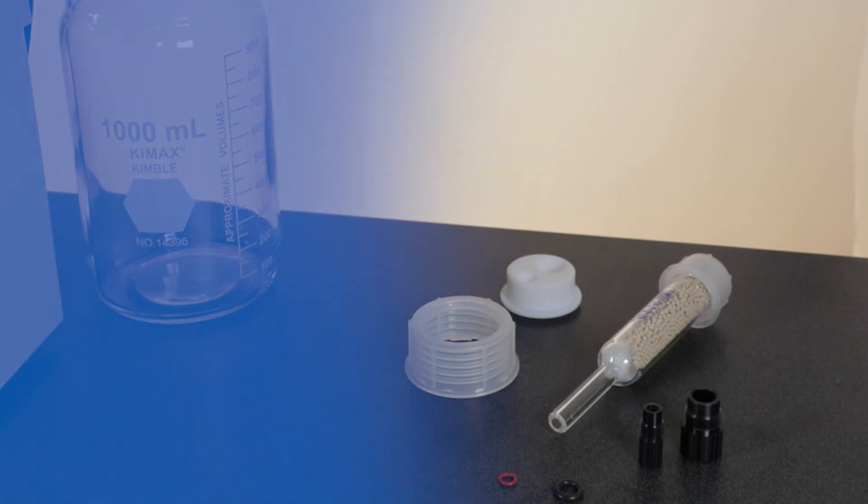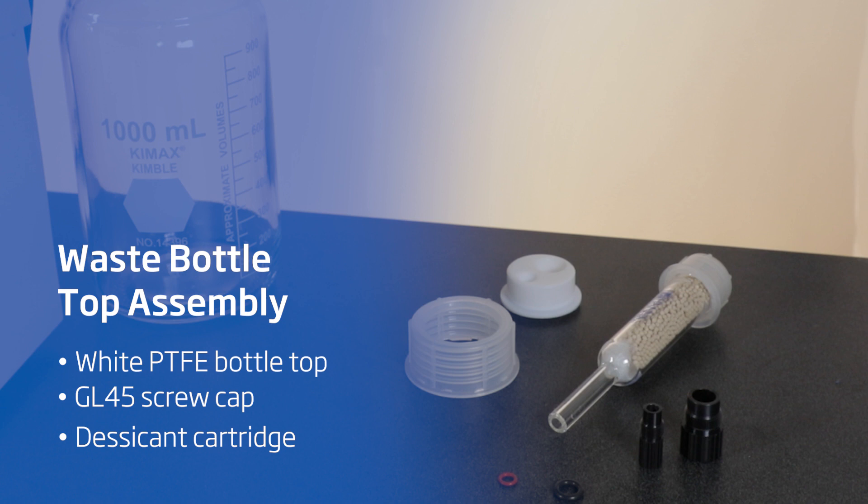For the waste bottle assembly, we'll need a white PTFE bottle top, GL45 bottle screw caps, and a desiccant cartridge with hose barbed caps.